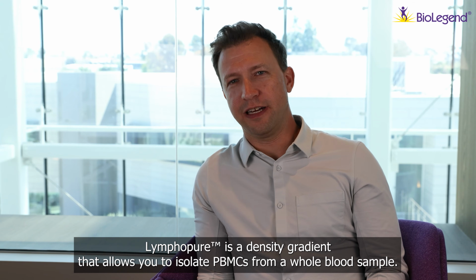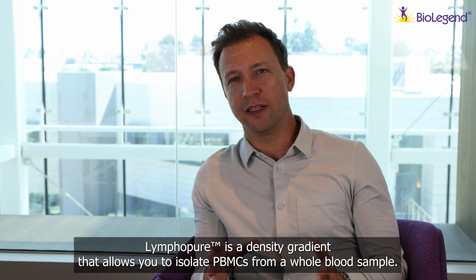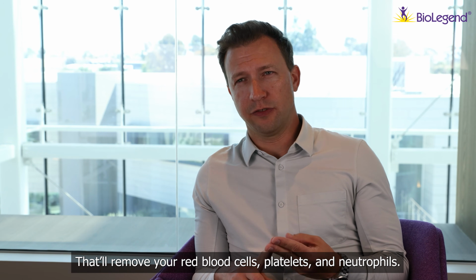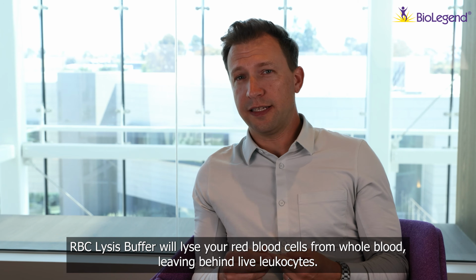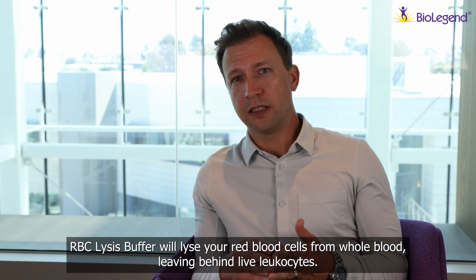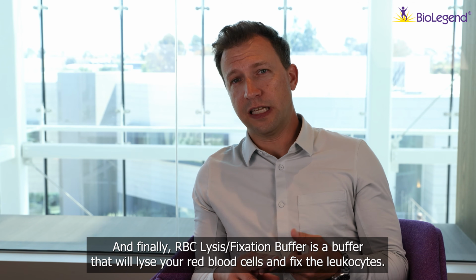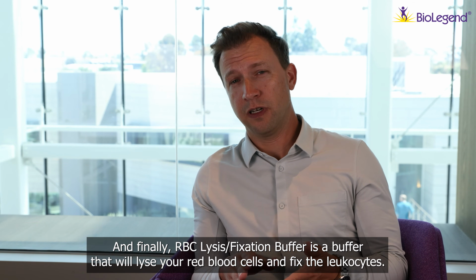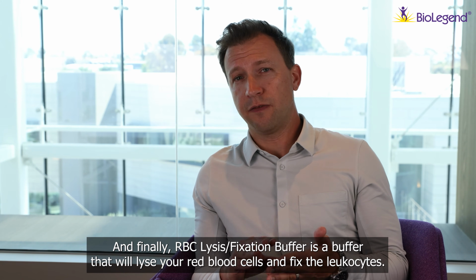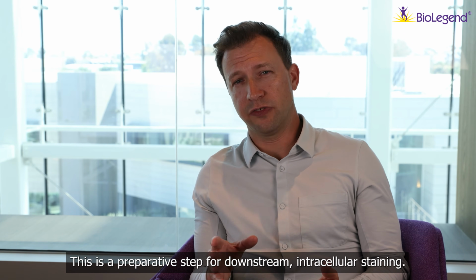LymphoPure is a density gradient that allows you to isolate PBMCs from a whole blood sample. That'll remove your red blood cells, platelets, and neutrophils. RBC lysis buffer will lyse your red blood cells from whole blood, leaving behind live leukocytes. And finally, RBC lysis/fixation buffer is a buffer that will lyse your red blood cells and fix the leukocytes. This is a preparative step for downstream intracellular staining.